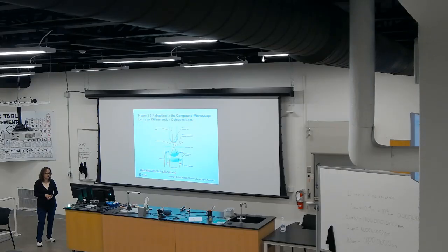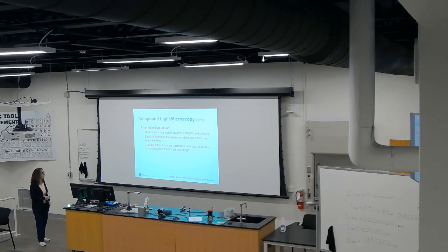I don't know if you have done this before, but if you put, for instance, a piece of paper with letters that are very tiny on the bottom of a glass, you will still see it tiny. But if you add a drop of water on top of that glass, the image is going to be magnified, and of course it has to be held, not going sideways. But if it's contained within that specific area, you will see that letter a little bit larger because you lose less light.